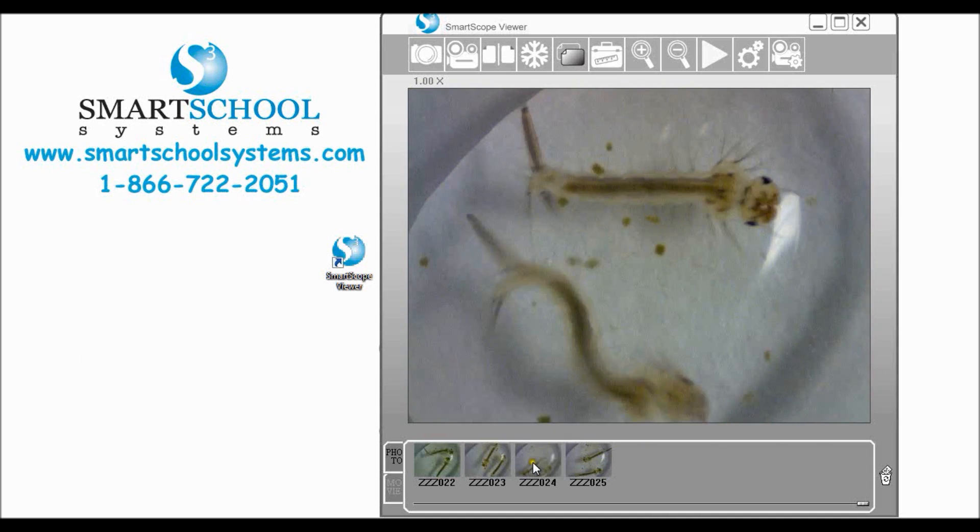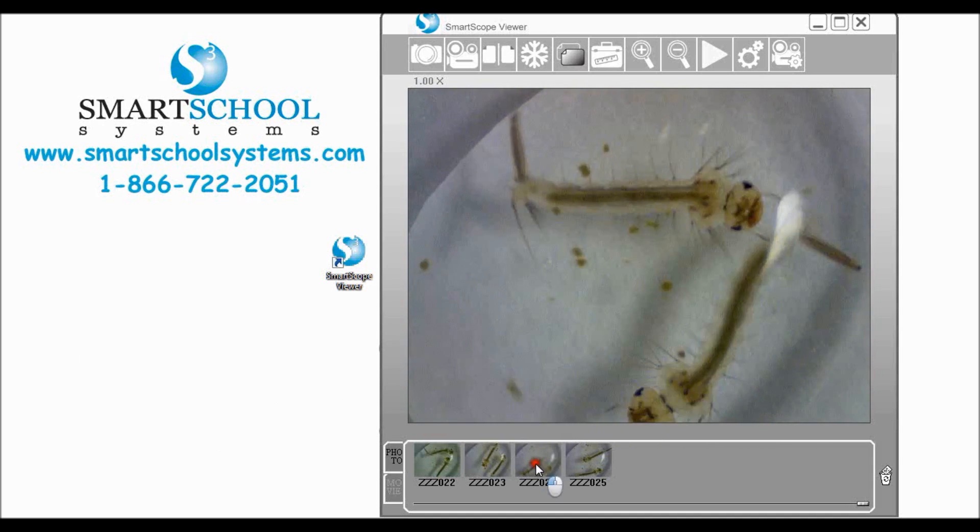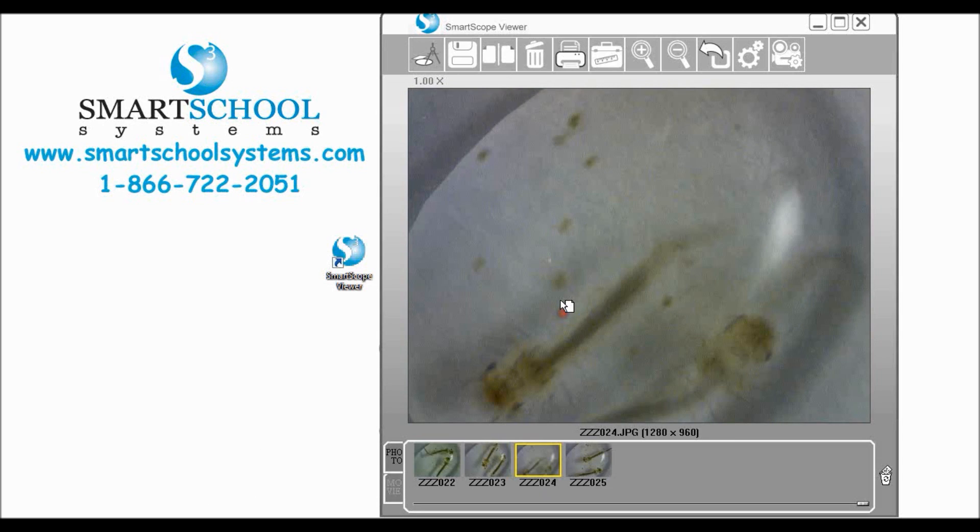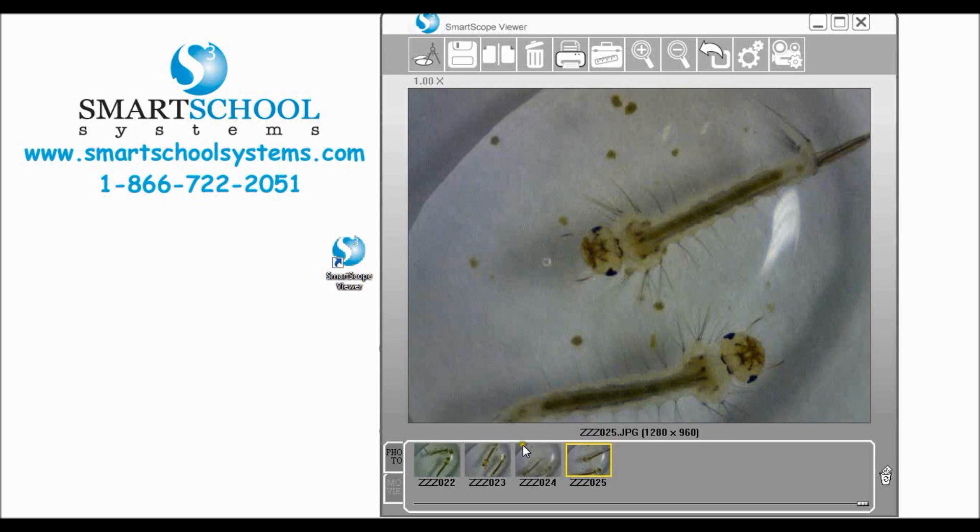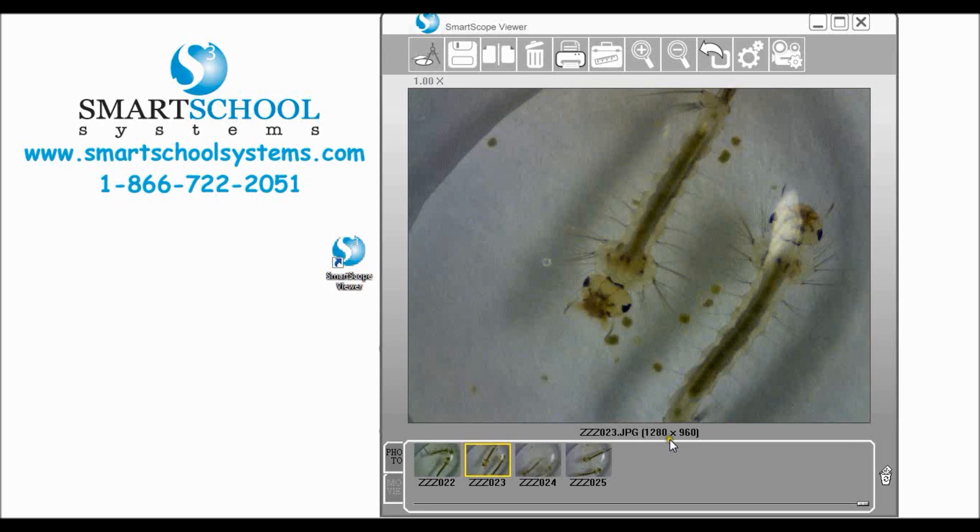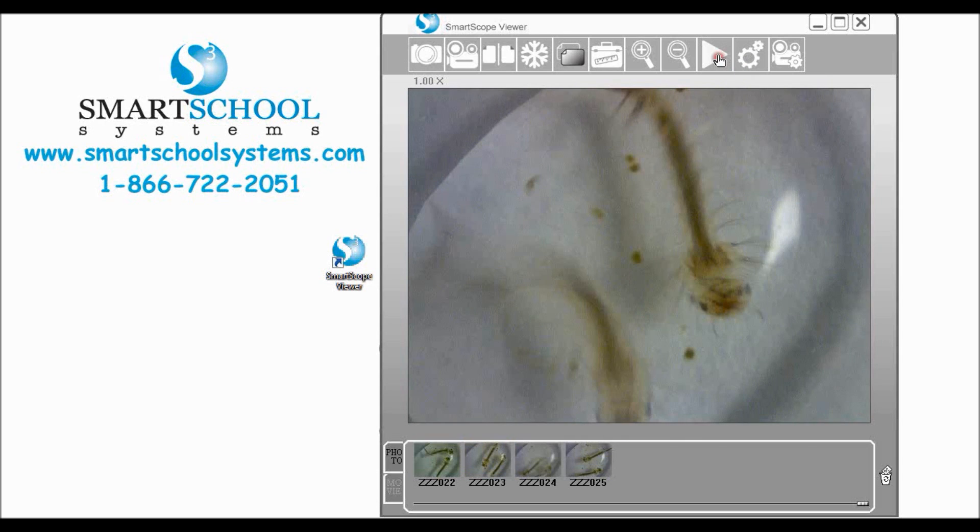If we want to see these images we can simply click and drag up into the viewing window and see those images again, and we can come back, go back to our live image by simply clicking go back.